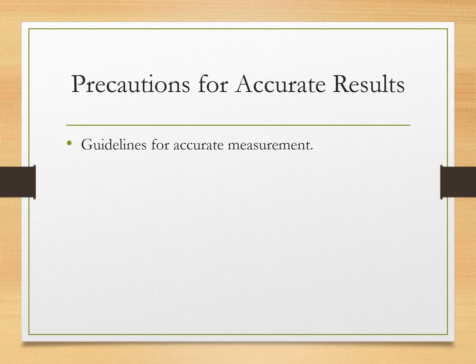Use the correct solvent. Ensure calibration. As we already discussed, if calibration is performed, it can be checked whether the instrument is working properly or not. So calibration is an important parameter to ensure accuracy.